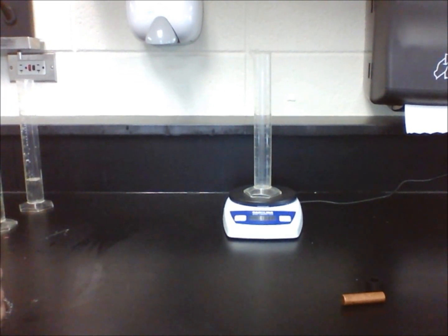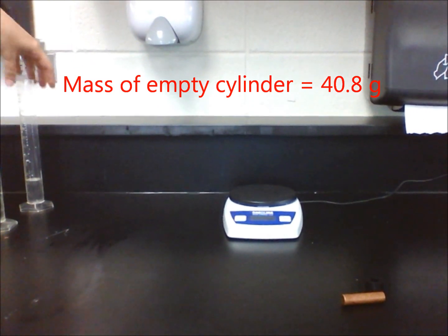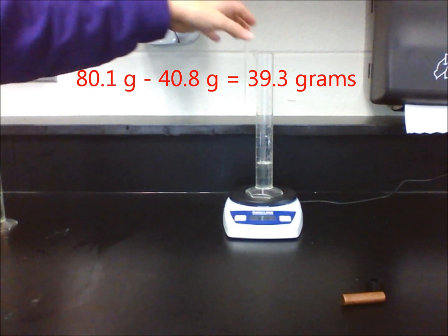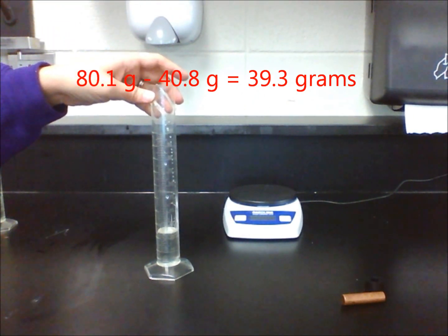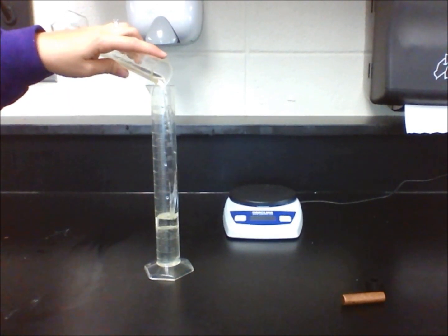Now, let's get the mass of just the corn syrup. Mass just the graduated cylinder on the electronic balance scale. Then, after pouring 25 milliliters of corn syrup in the graduated cylinder, mass it again on the scale. Subtract the original mass from the new mass to get the mass of just the liquid. Divide mass by volume to get its density. The answer should be around 1.6 grams per cubic centimeters.